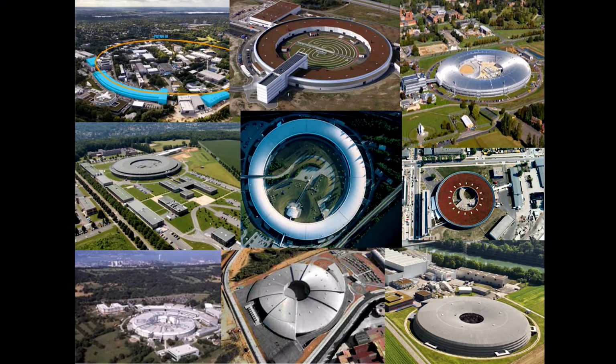These days, there are loads of synchrotrons now. These are the main European ones. Most of the countries in Europe have a facility or have access to the ESRF over in Grenoble. These are now 1 kilometer sized machines, high energy. At the ESRF, we're at 6 GeV. I think MAX IV is 3.0 GeV. So the two are complementary, delivering different types of X-rays.